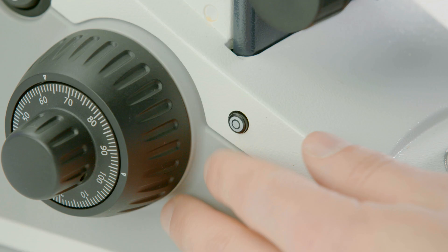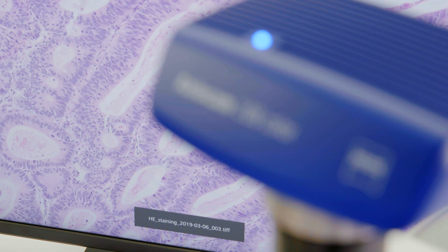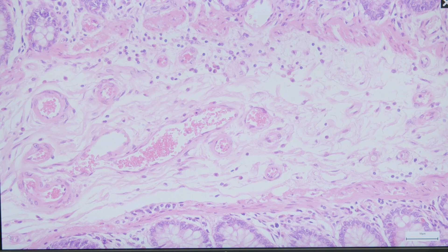Press Snap and there you have it. Your bright-field image as it appears through the eyepieces, including the right scale bar, is ready and waiting on your USB stick.